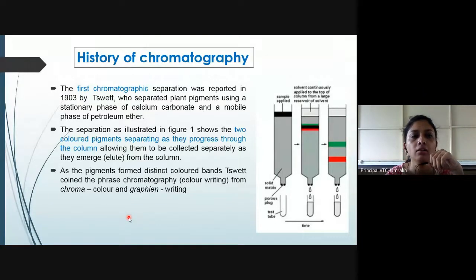We can say that this separation technique was started about 100 years ago, but it is being used very strongly nowadays, because even in different pharmacopoeias, many of the UV methods which were used for different kinds of drug analysis have been replaced with chromatographic methods.